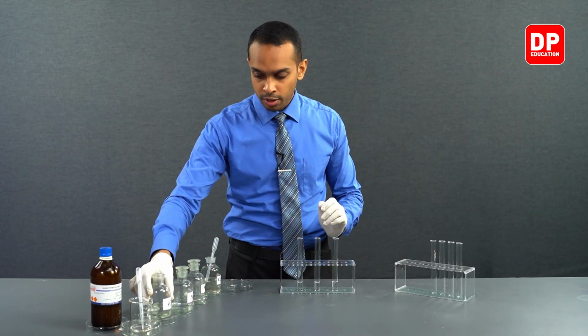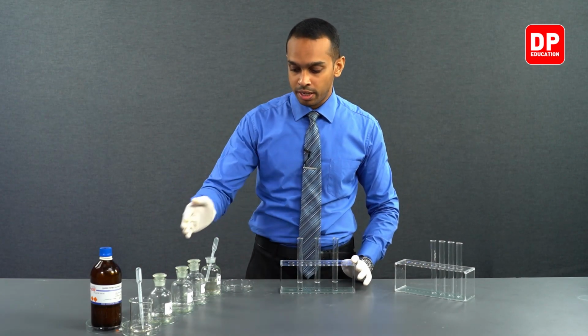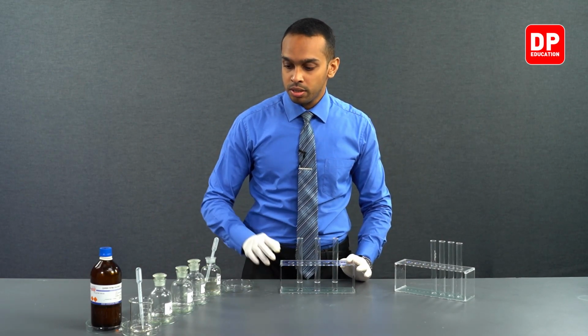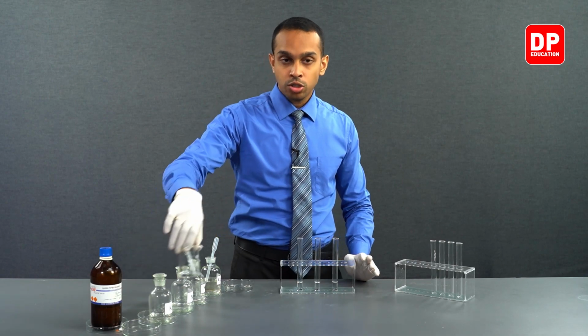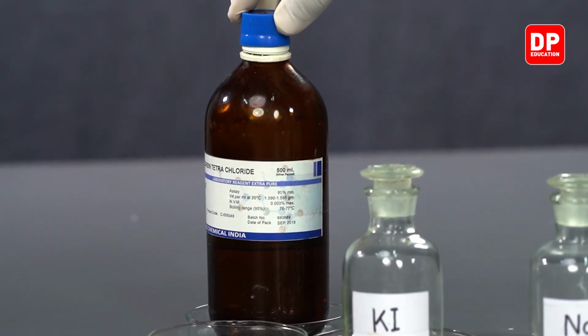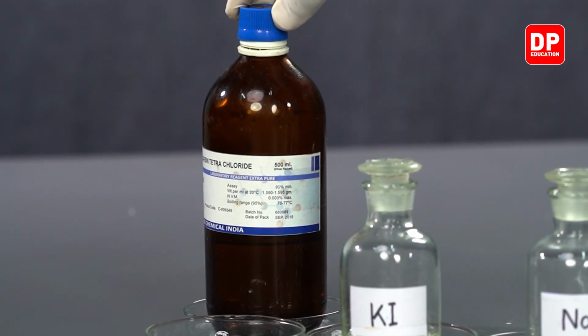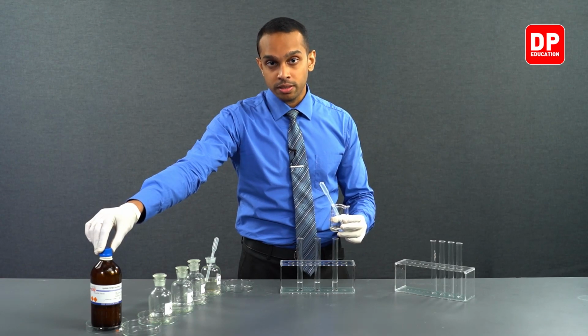And now we have taken 3 test tubes, and into those 3 test tubes we have taken the halide ion solutions. Now let's transfer small amounts of carbon tetrachloride, CCl4, which is our organic solvent.